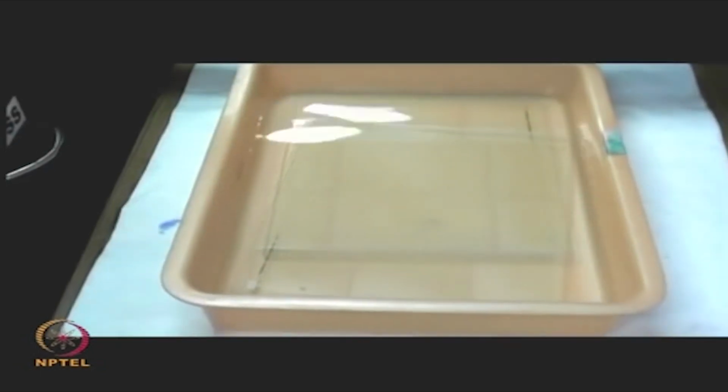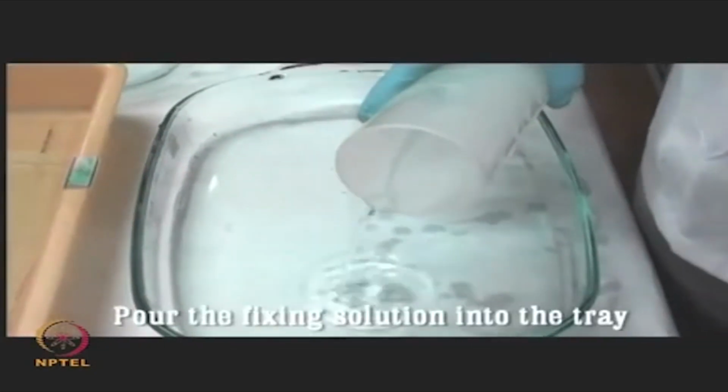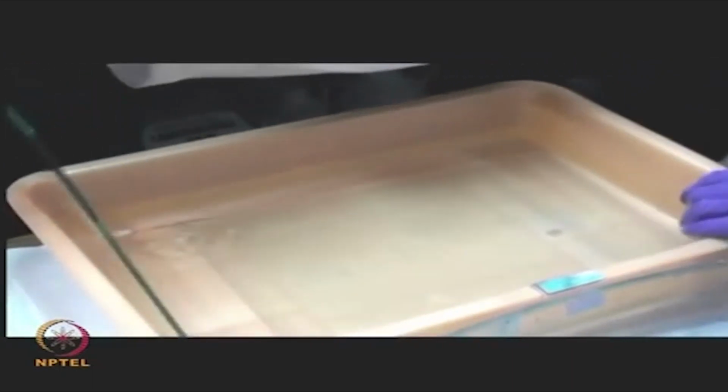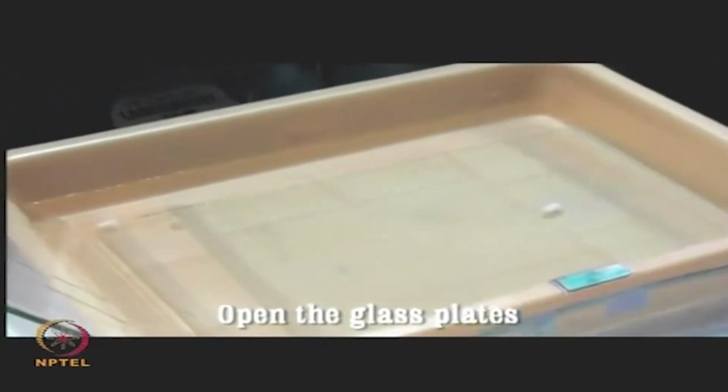Soak the gel present between the glass plates in fresh distilled water to remove any bound SDS. Pour the fixing solution containing methanol and acetic acid into another tray. Open the glass plates and carefully remove the IPG strip from the gel.